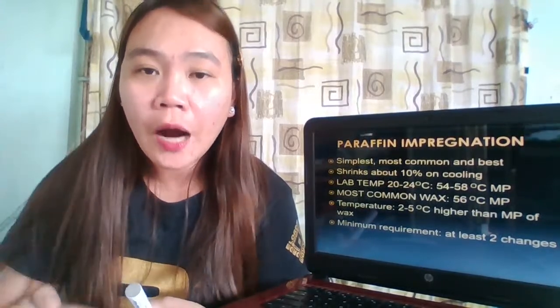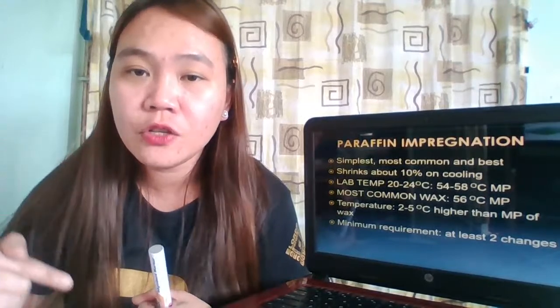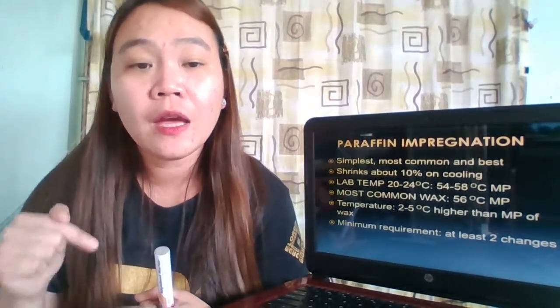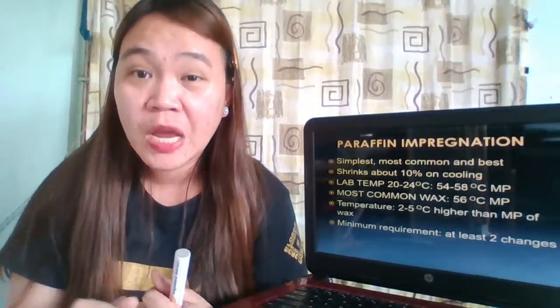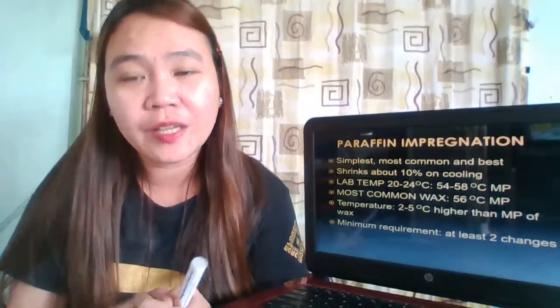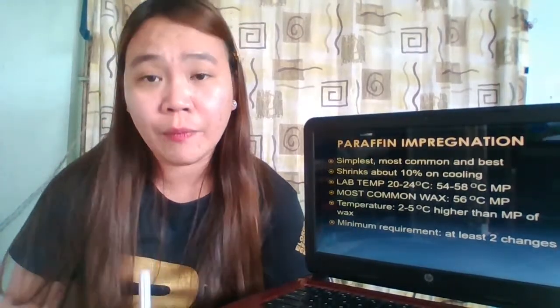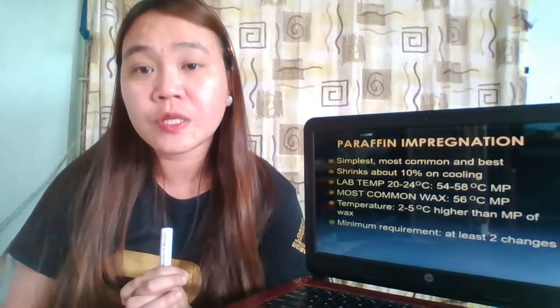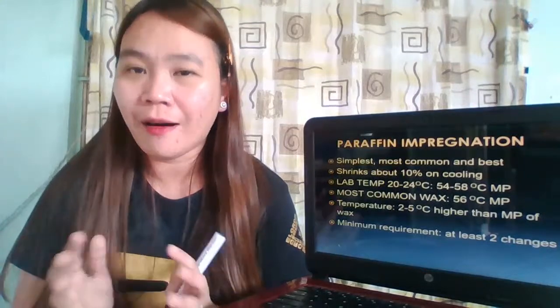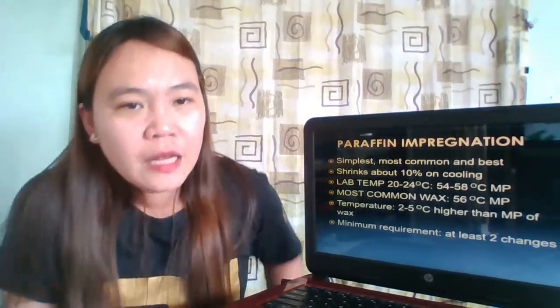For hard blocks, we make use of heavy duty microtomes. So later on, when we will be discussing microtomy or sectioning, I will also be mentioning the different heavy duty microtomes that we can use if the block that we are cutting is considered to be hard.